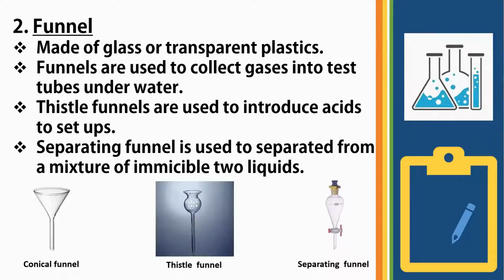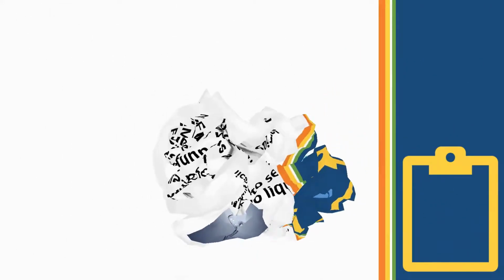Funnel. Made of glass or transparent plastics. Funnels are used to collect gases into test tubes underwater. Thistle funnels are used to introduce acids to setups. Separating funnel is used to separate a mixture of two immiscible liquids.